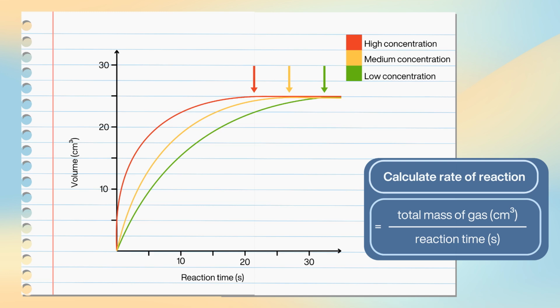With these calculations and graphs ready, we can see that increasing the concentration increases the rate of reaction. Specifically, the curves of our graphs are steeper when the concentration is greater, and the value for our reaction rates are greater. Again, this finding matches the predictions of collision theory. When the concentration of a reactant is higher, there is a greater frequency of collisions, leading to a higher reaction rate.